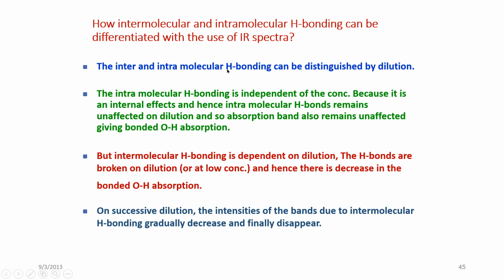So the inter and intramolecular hydrogen bonding can be distinguished by dilution. In case of intramolecular hydrogen bonding, it is independent of the concentration because it is the internal effect. Hence, intramolecular hydrogen bonds remain unaffected on dilution, so the absorption band also remains unaffected, giving the peak at the same position in the IR spectra.